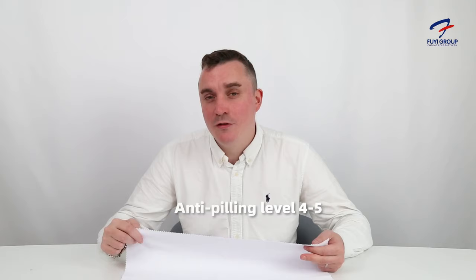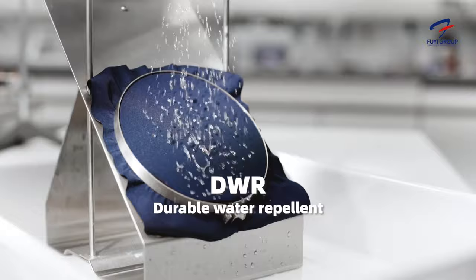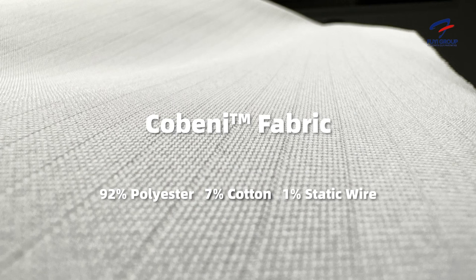It also has an anti-piling level of 4 to 5 — 5 is the best — and this material has a great drape ability. It's also anti-wrinkle. We applied a DWR function, which is durable water repellent. This is a polymer that's added to the fabric in the last process of production.